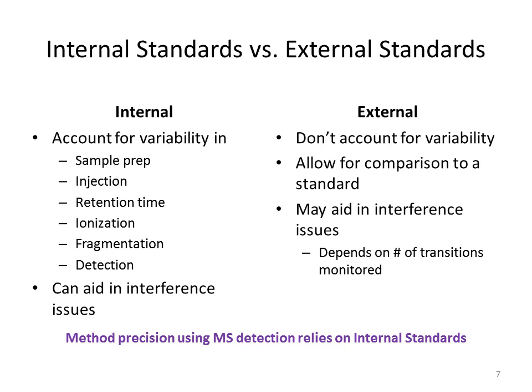For example, how many people have done the Bradford absorbance assay or the BCA assay for protein concentration? Right, show of hands. So what do you do? You take a standard, you dilute it, you generate a response curve, you get the absorbance measurements, and then you add the stuff to your unknown at the same time and get that absorbance measurement, right? And then you take the absorbance you get from your sample and you plot it on that curve. So that's an external standard.